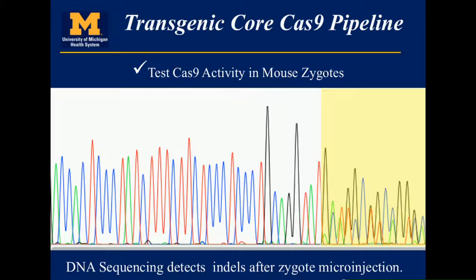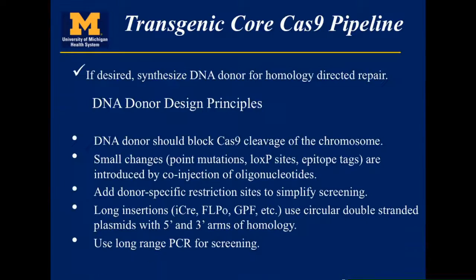And the sequencing technician says, sorry for your lousy run, you gave us a sample that was contaminated with multiple templates, but that's okay, that's what we want to hear. And so then some basic principles on designing the donor.